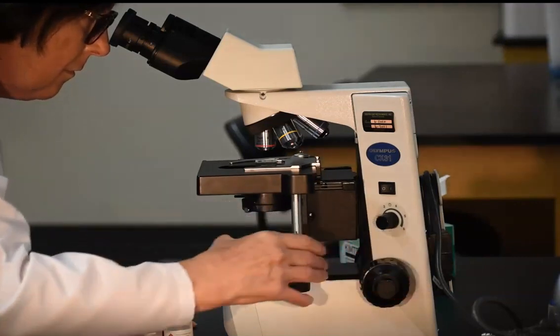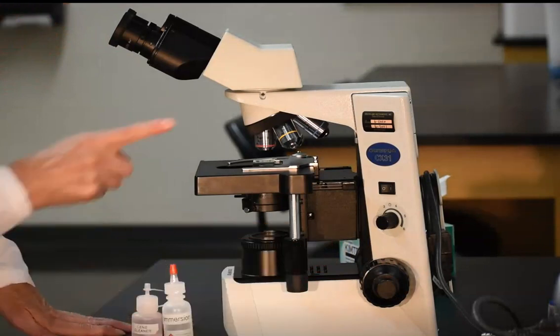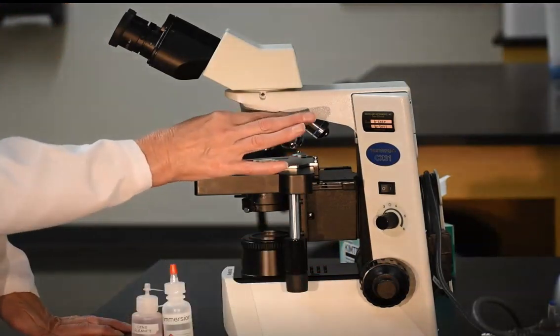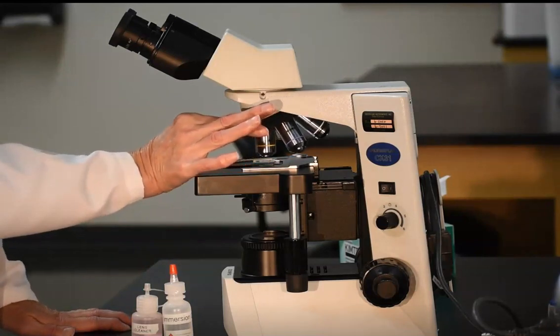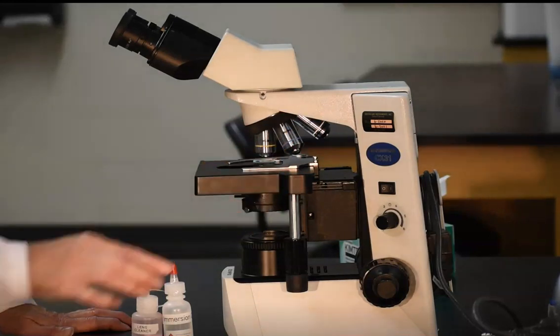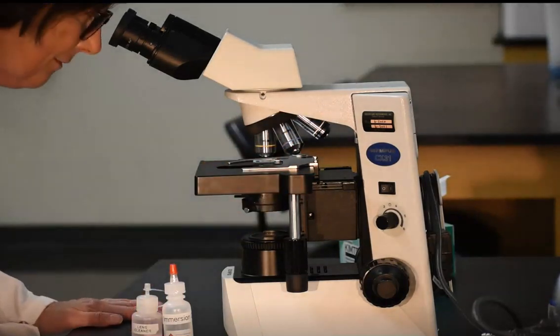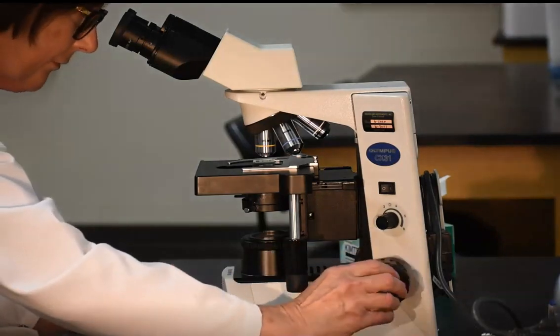Once you have the object in focus with the 4x scanning lens, you'll switch to low power. You switch the lenses by grasping the ring and rotating the next lens into position. Don't yank the lenses to move them into position. Keep both eyes open when viewing through the microscope. To bring the specimen on the slide back into focus, only use the fine focus knob.